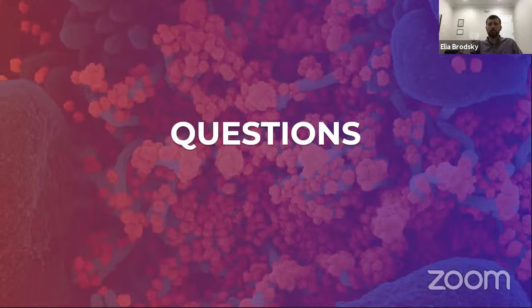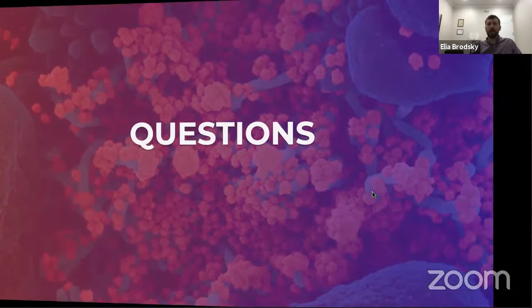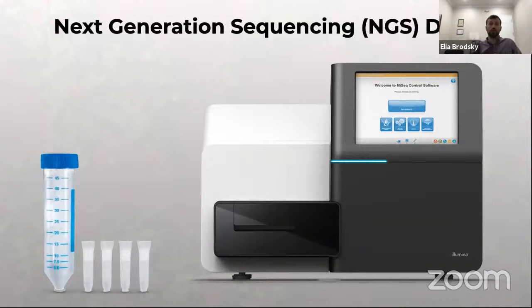So let's talk about next generation sequencing. What is next generation sequencing? What kind of data does it produce? What can we do with that data? So the process of next generation sequencing is when we take a sample of biological material, for example, saliva, and we can then sequence the DNA or the RNA that is inside this biological sample.